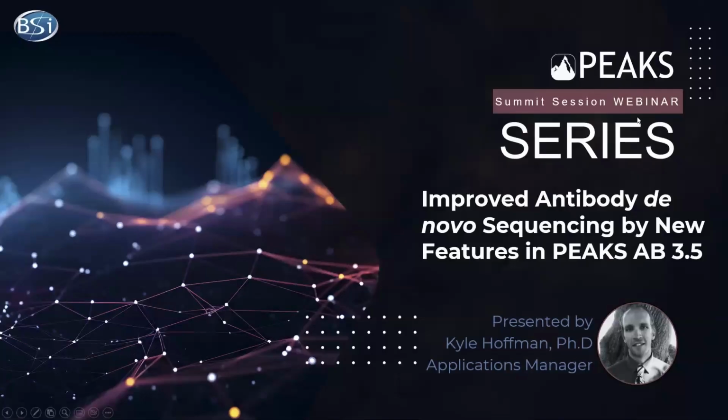Great. So yeah, I'm pleased to announce that we're going to be releasing a new build of our PeaksAB software in the coming weeks. And so today I'll go over how we've improved antibody de novo sequencing in the new build and give an overview of the new features.